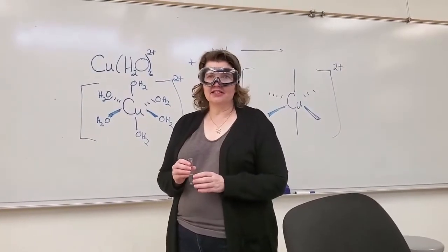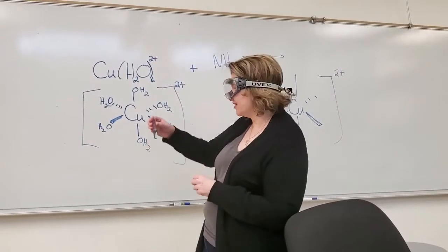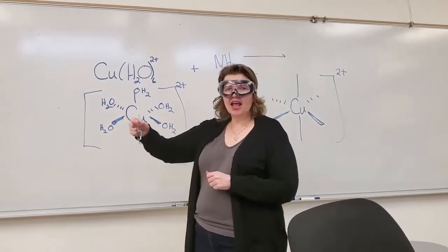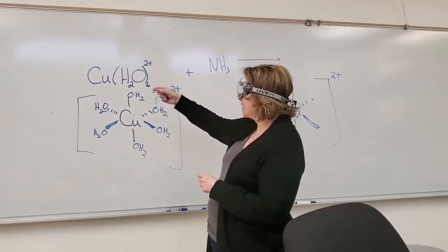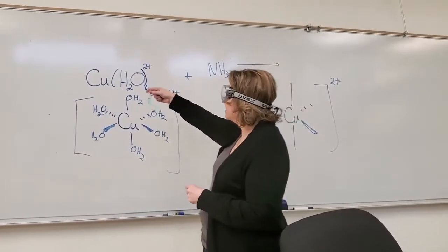This is part A of the Le Chatelier's Principle demonstration from the Le Chatelier's Principle lab. In part A, we're going to play around with the copper complexation equilibrium.